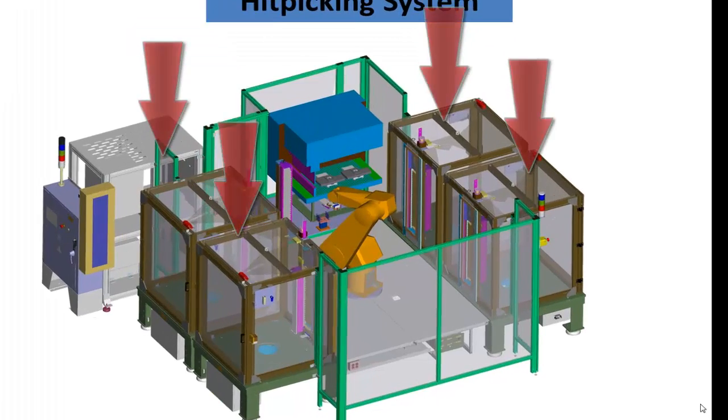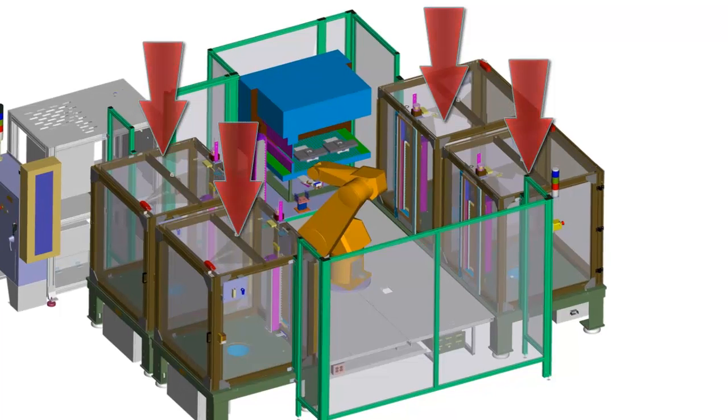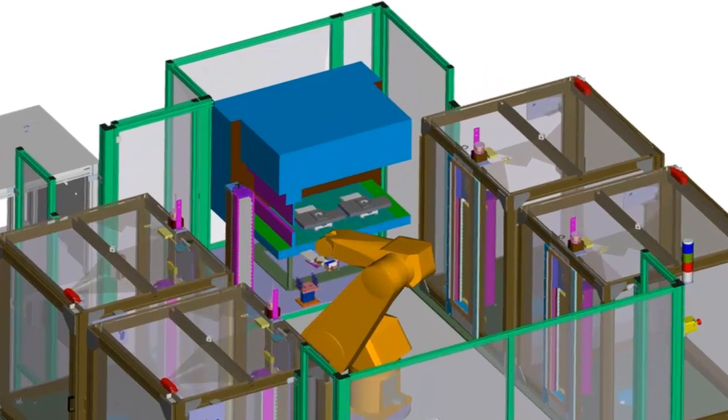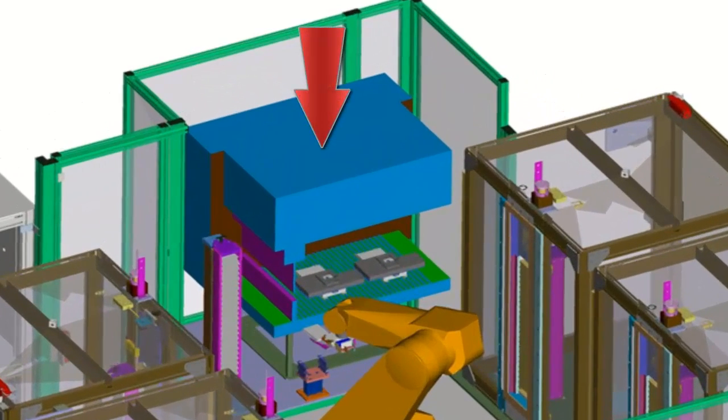This slide is the model of the hit picking room. Again, the robot is in the center, there are 4 chambers for compound plates, and on top of that, there's a TECAN liquid handling station to organize all the hits into one plate.